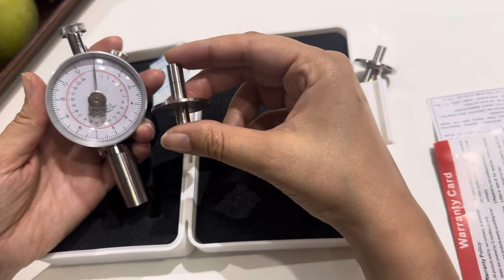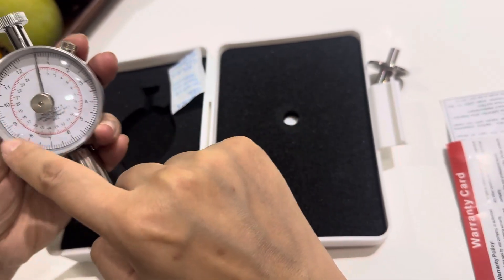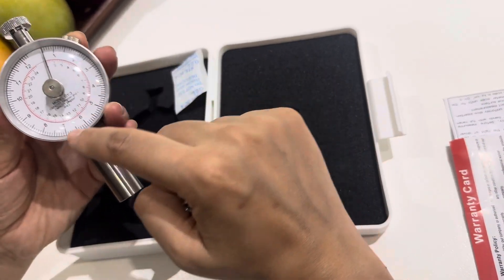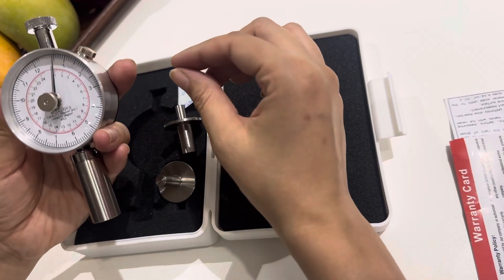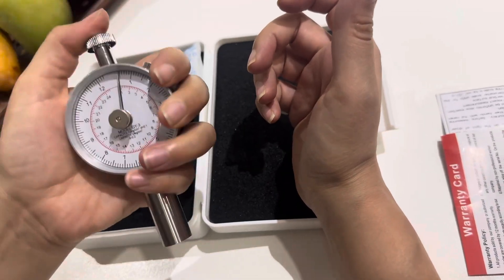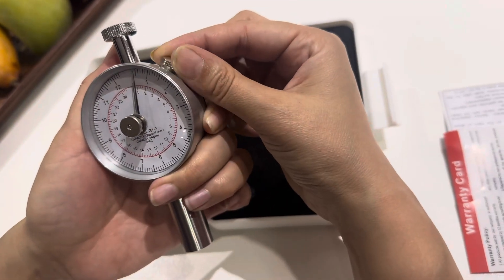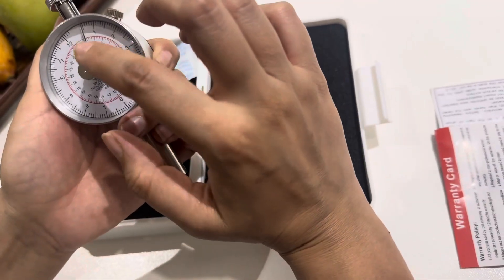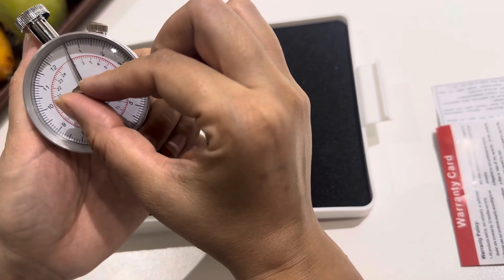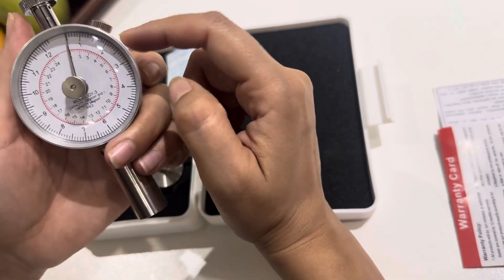So it's very simple: when using the 8 mm pressure head, check the inside scale; when using the larger 11 mm diameter pressure head, check the outer scale. The top of the instrument has a professional rack to hold and apply pressure. Apart from this, there is a side retention knob that rotates and helps the mid zero knob rotate on its own, so every time we take a reading it should be on the reset phase.